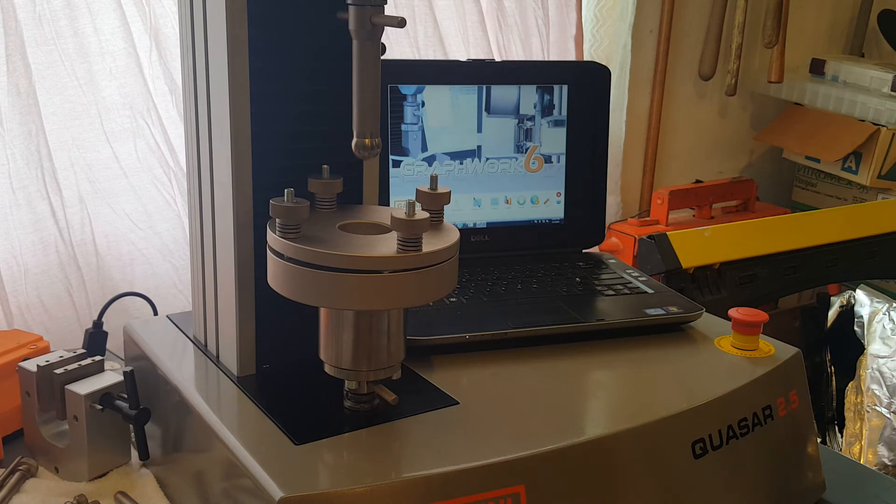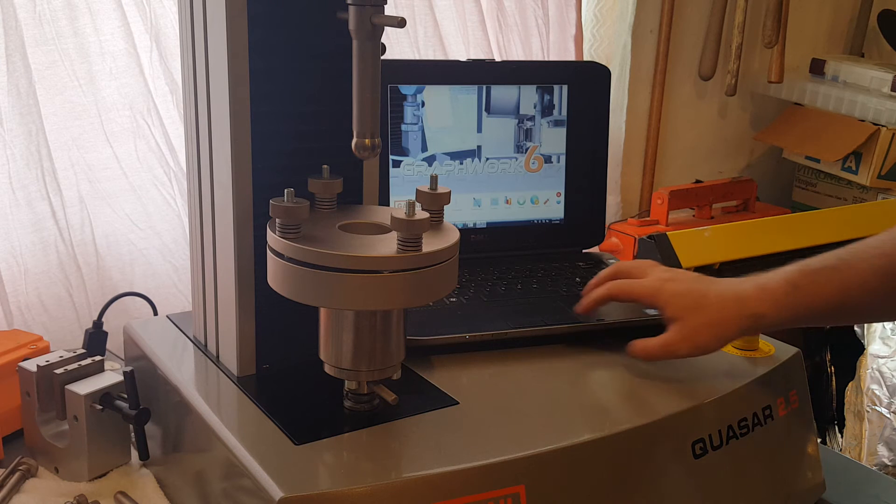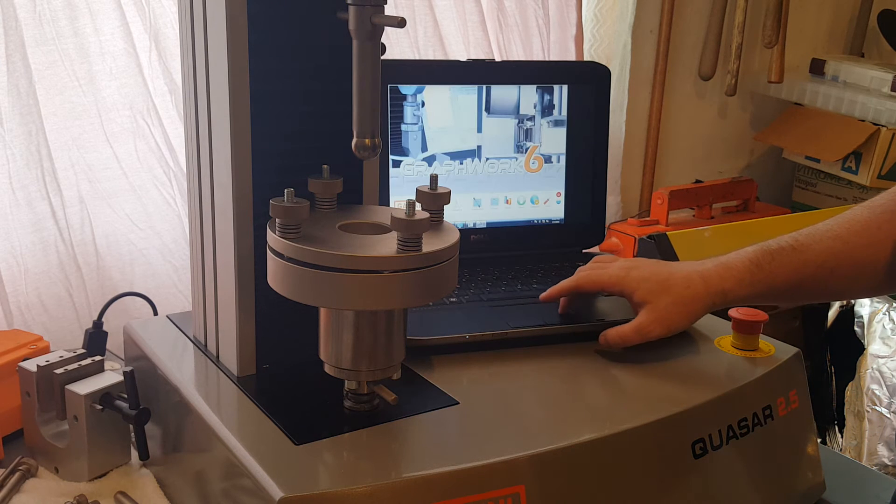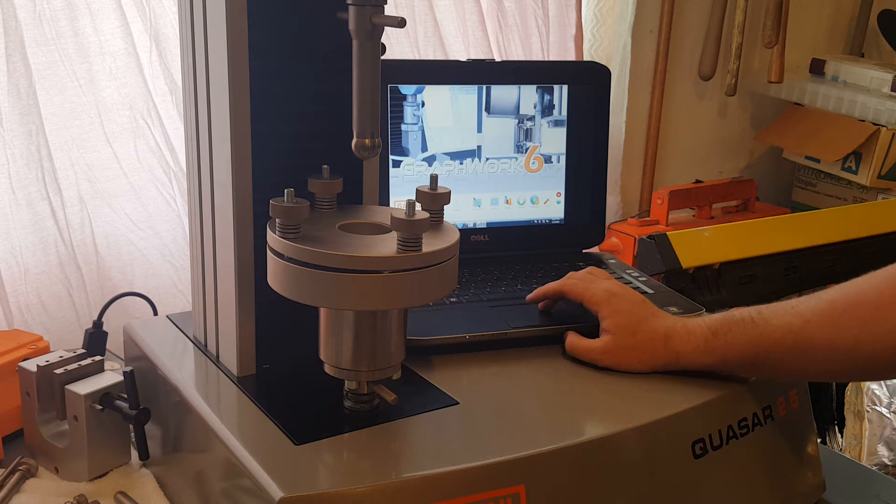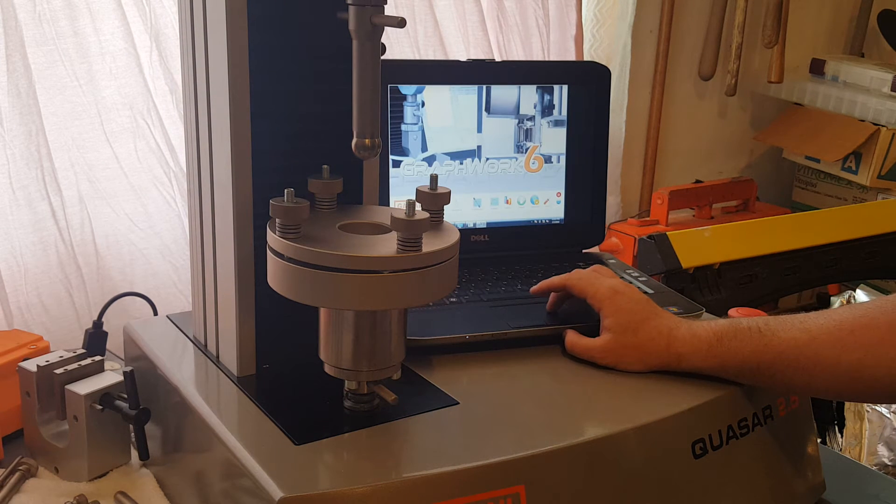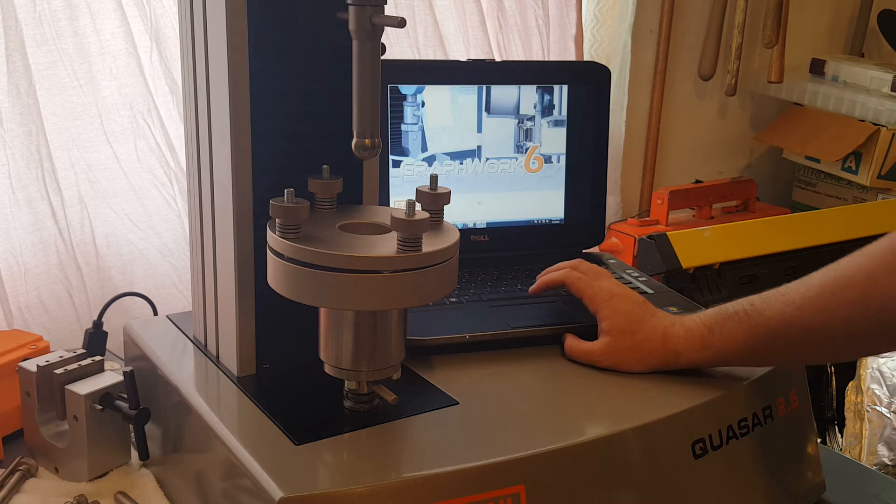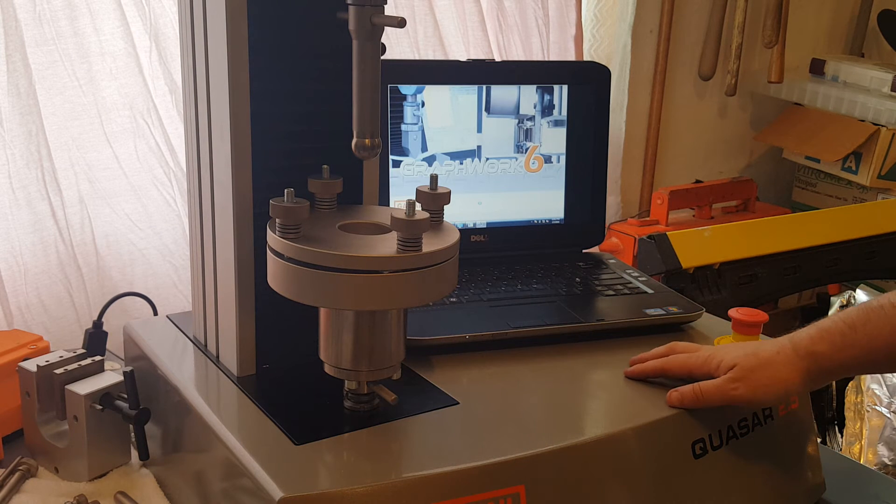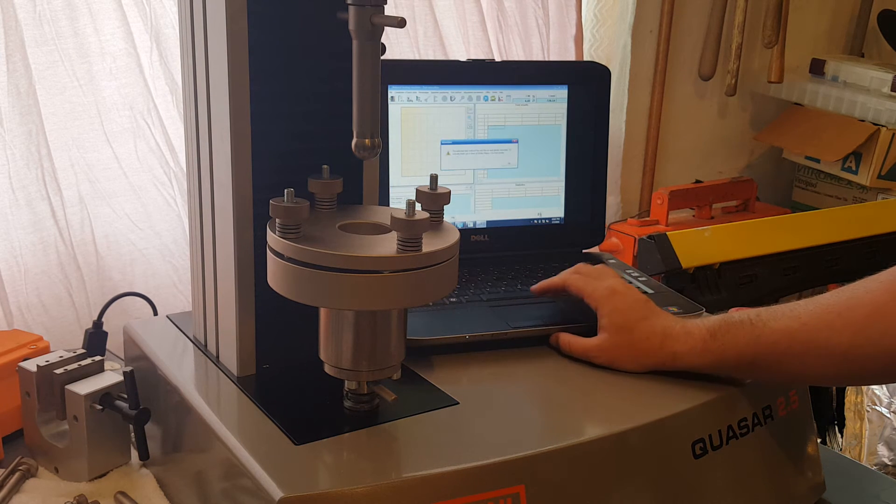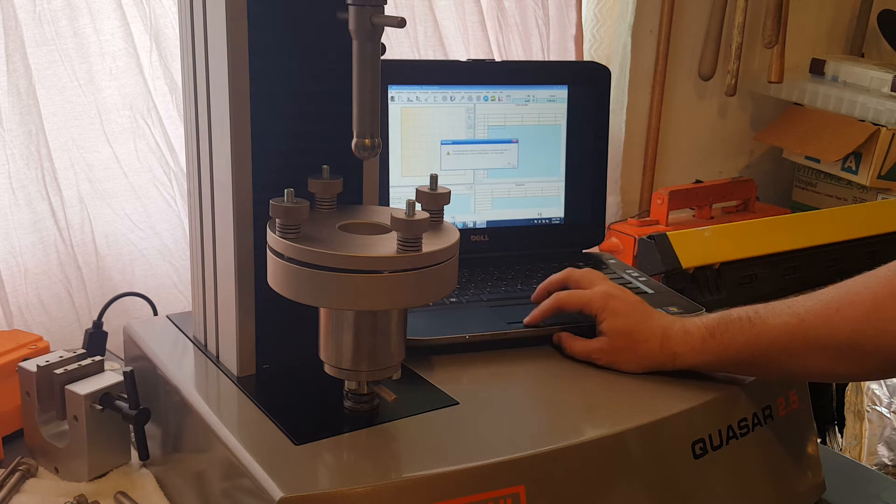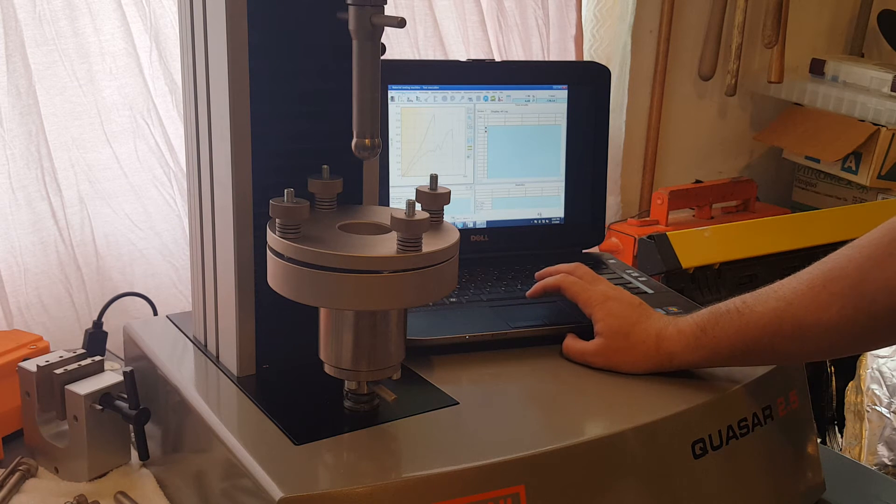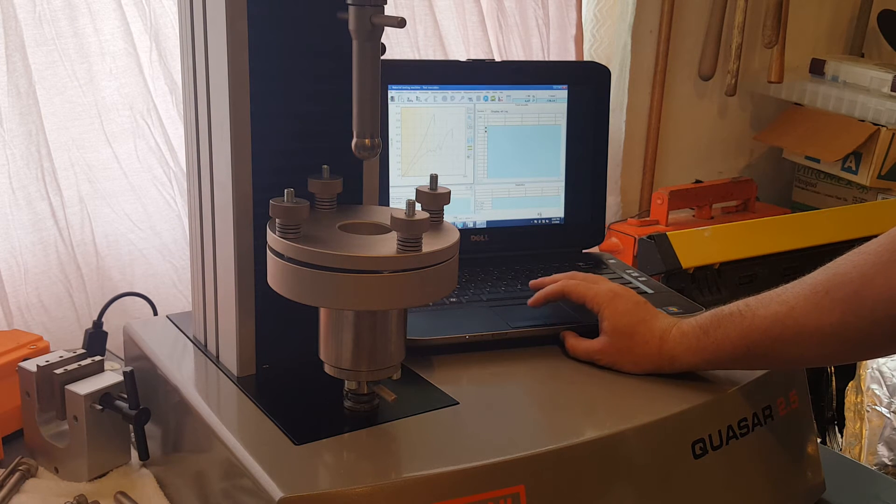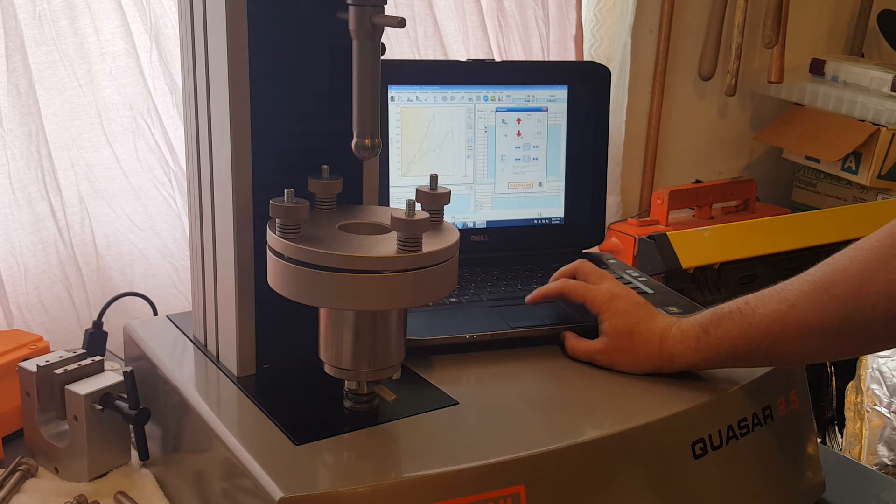There we go. It's mounted now. So we're going to go ahead and start our test. We'll go into my GraphWorks 6 Galdabini testing software, go over to test execution. Now I've pre-configured the test so everything's going to run basically as soon as I hit go.